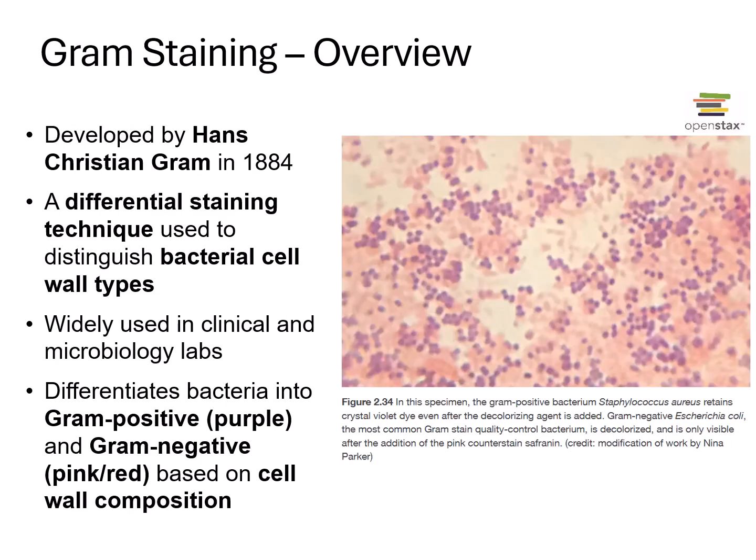The gram stain is a differential staining technique that's probably considered the most important and most commonly used technique in the micro lab. So this differential staining method allows us to classify bacteria into two main groups, gram-positive bacteria and gram-negative bacteria. Gram-positive bacteria will appear purple after the gram stain, and this is going to be because they have a thick cell wall, whereas gram-negative bacteria will appear pink after the gram stain because they have a thin cell wall.